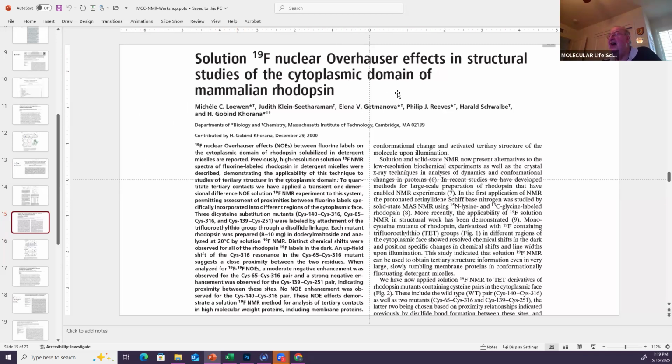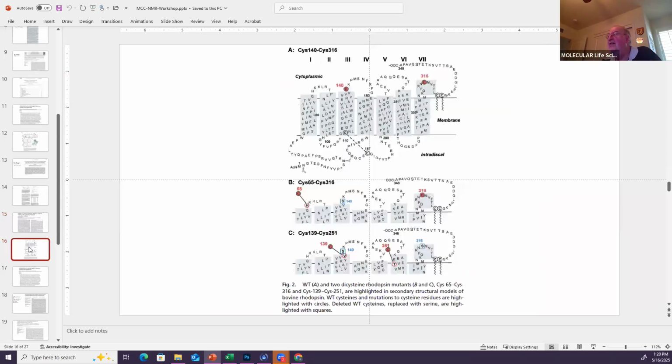After they've done that, I've had them collect a 2D spectrum of lysozyme, which has a nicely defined 2D spectrum. Never done it with fluorinated anything, but it gets them into understanding what the NMR is all about, which I think is really useful.